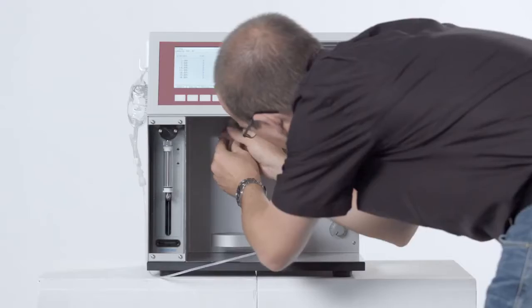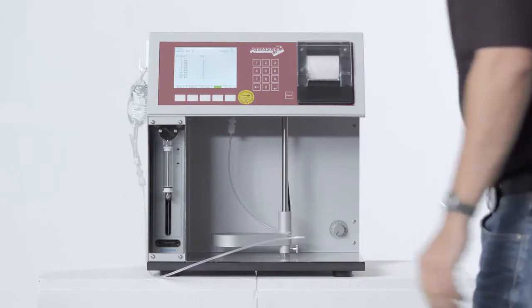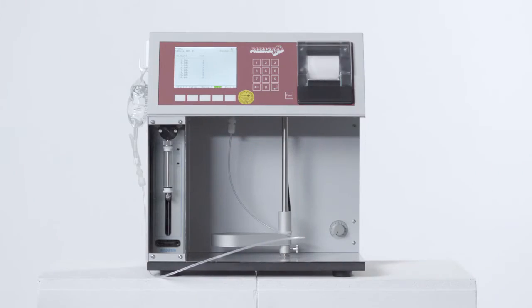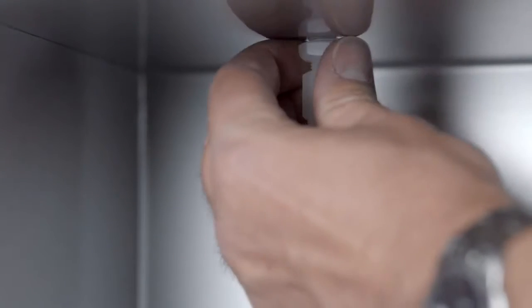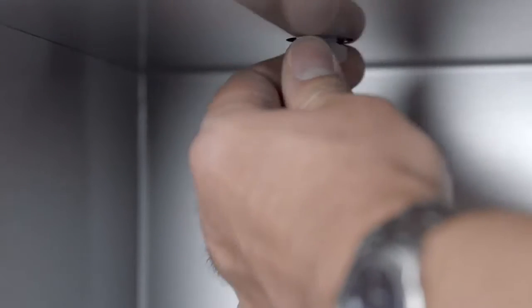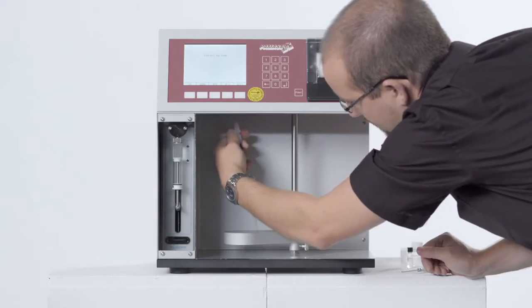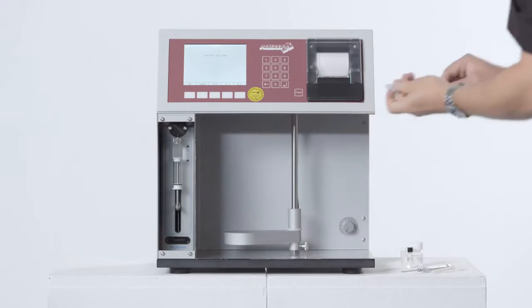For this example, the infusion bag tubing with the standardized tube connector is simply screwed into the PAMAS SVSS inlet port.